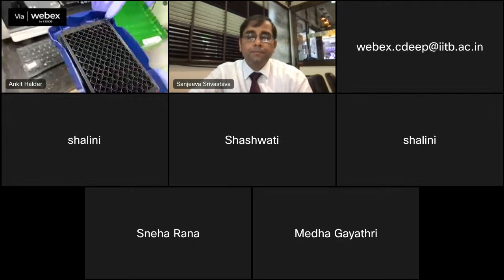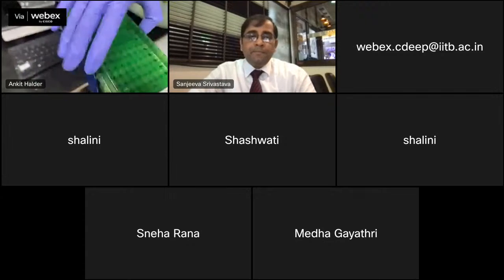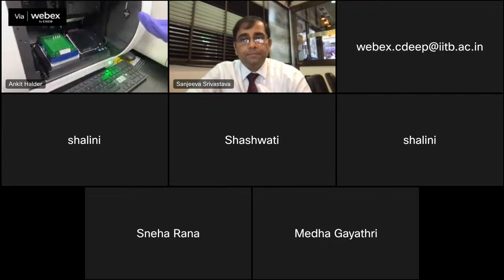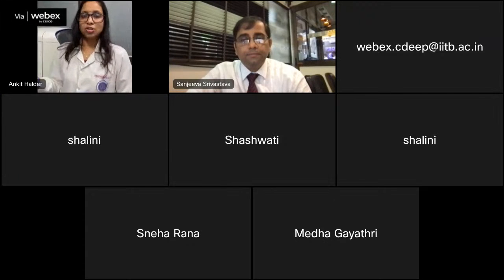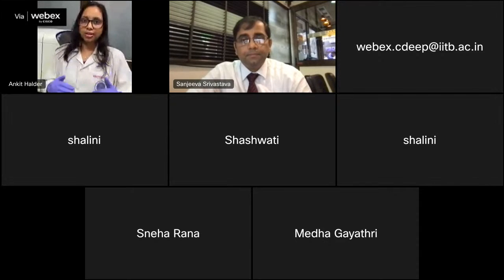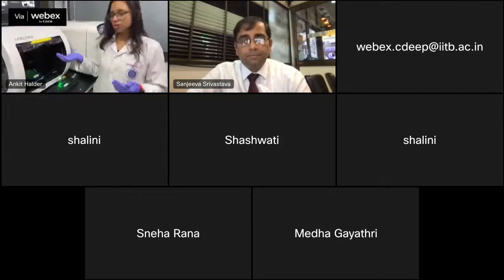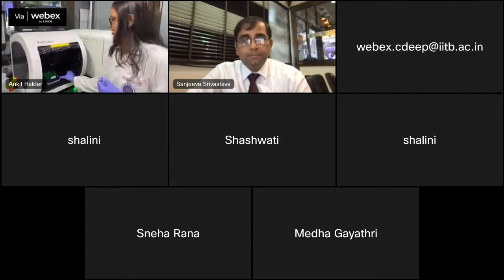Here we have already added the solution so that the sensors can be hydrated, because the sensors that come to us are coated with a high sucrose condition. On this particular one, we have protein A biosensors, with sensors coated with protein A, and to avoid the degradation of the protein, we have a coating of concentrated sugar so that it is protected from any kind of damage. That's why we need to hydrate the sensor before starting the experiment.